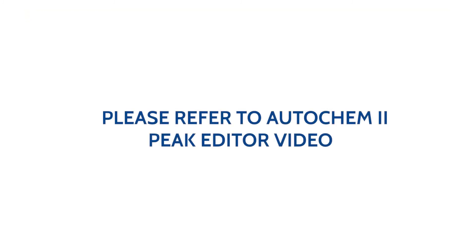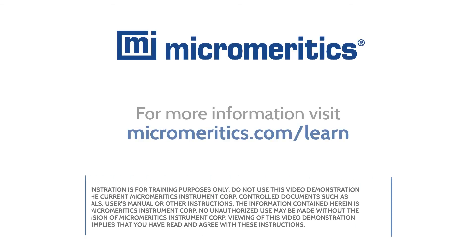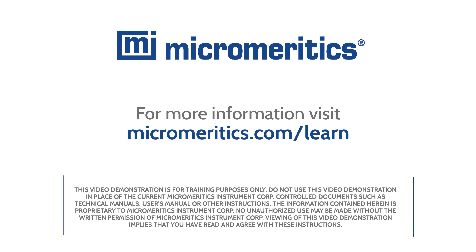Please refer to our AutoChem 2 How to Use the Peak Editor video demonstration for more information. And that completes this demonstration on how to run a pulse chemisorption with platinum alumina reference material on the MicroMeritics AutoChem 2 Automated Catalyst Characterization System. For more information, visit micromeritics.com/learn.